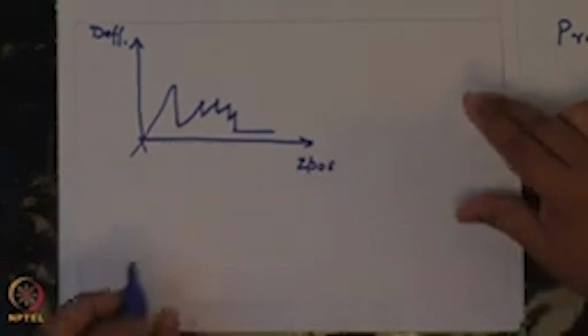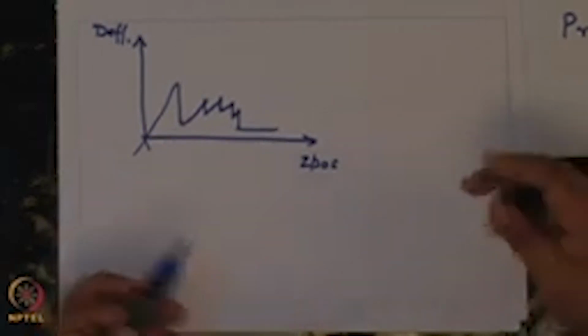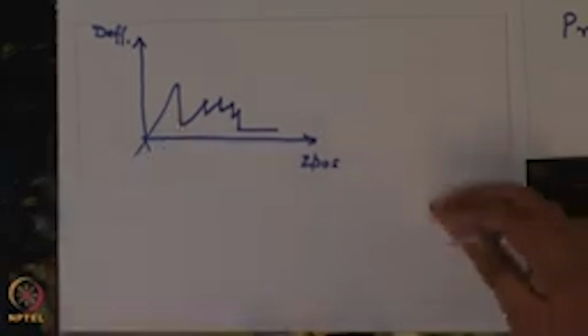Now let us think as to what is happening. Why does it generate this particular structure, and why do we say that this is a signature associated with protein folding? Let me approximate the protein. On the surface there is a protein which is lying down, and this is your tip. If I zoom in, let us assume that the protein has some structure like this.